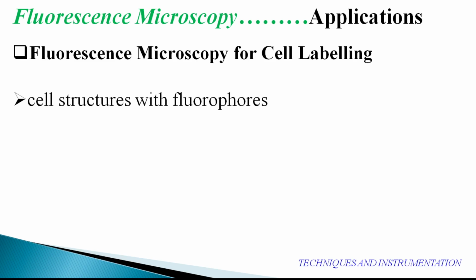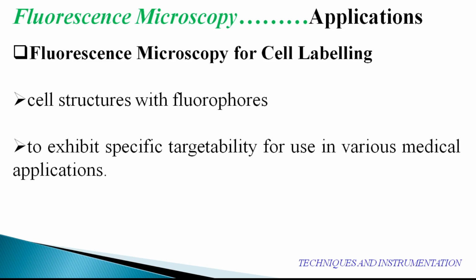So my friends, fluorophores with high specificity are routinely used in medical diagnostics. So you have to remember this part. So I repeat, fluorophores with high specificity are routinely used in medical diagnostics. With increasing research findings, further applications for fluorescent cell labeling have been enhanced also. I'll tell you an example.